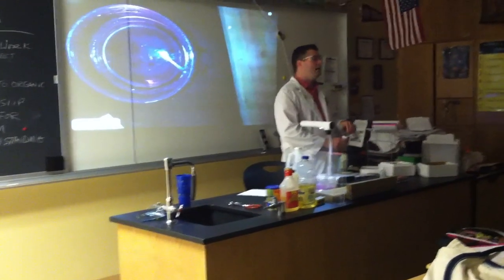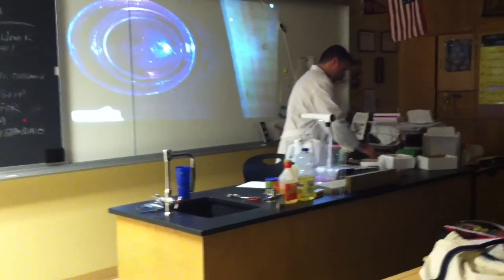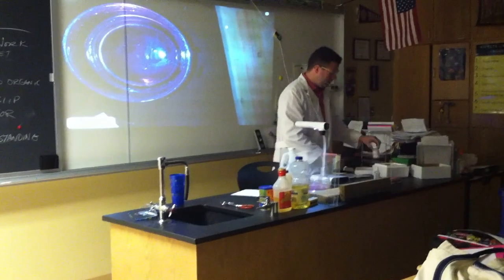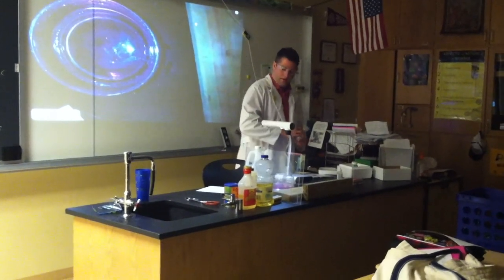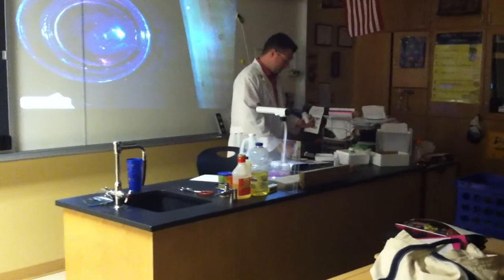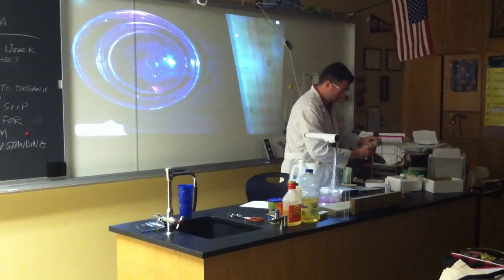So what is it? Sodium, is it more reactive or less reactive? More reactive. All right, so we would expect a lot more of a reaction here. So we're going to go ahead and get out some lithium. Again, we got to get it out of the plastic bag. What do you mean sodium? Yes, sorry, sodium. Thank you.